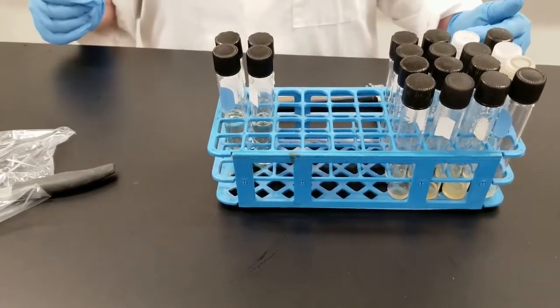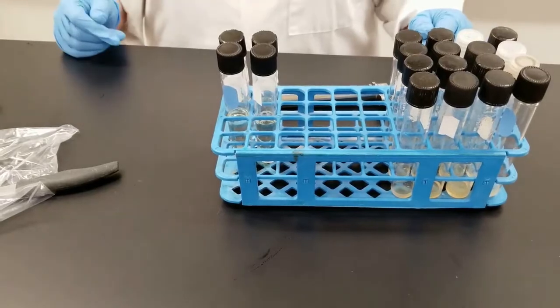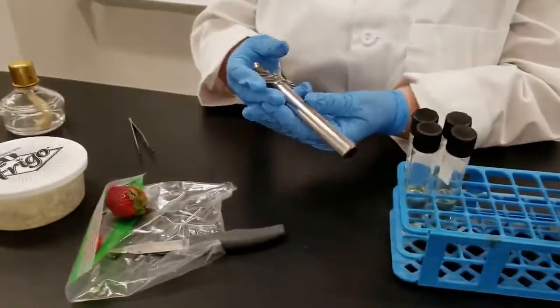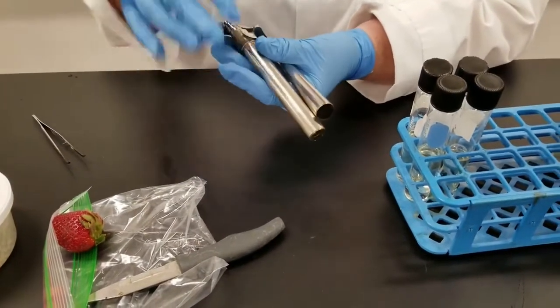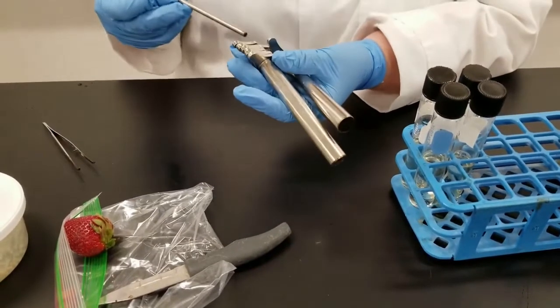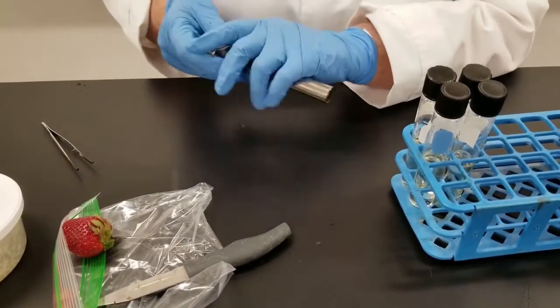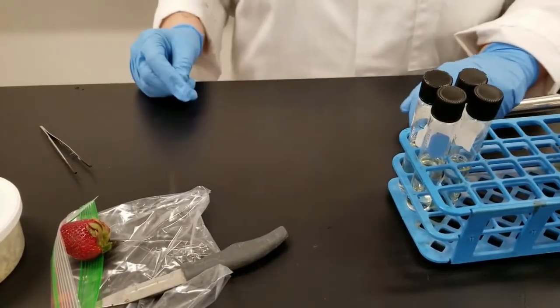You can grow fungi on agar plates like you do bacteria. We don't use an inoculating loop to do that. Because of the fact that they do grow differently, we often use this type of an apparatus. You can select what size of a plug you want to pull out from a petri dish and transfer to a next one, whether you want a smaller size or a larger one. This is very helpful, say, in research where the size of inoculum needs to be consistent. And you would just pull the plug from one plate with the growth and plop it on top of the next plate.